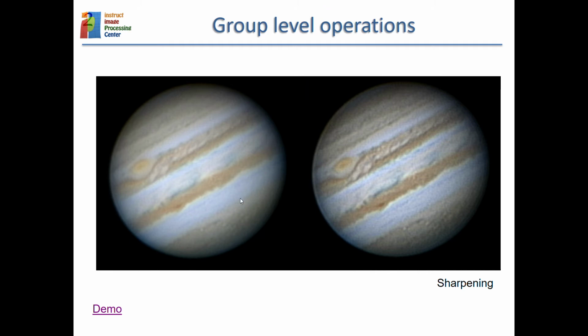And then we can have kernels that compute borders. For instance, this one is computing vertical borders, and this one is computing horizontal borders. That is why this fiber here is seen when you apply this kernel, but it shouldn't be so visible when you apply a kernel that computes vertical borders, because it doesn't have a vertical border, it has a horizontal border. So it has a border only when you travel in this direction, not when you travel in this direction.